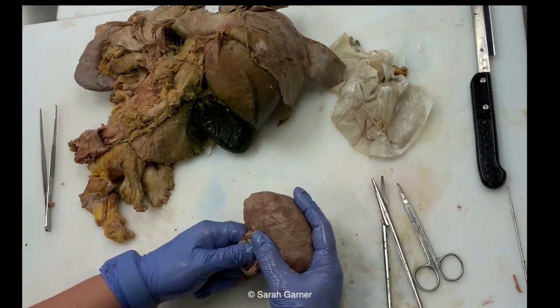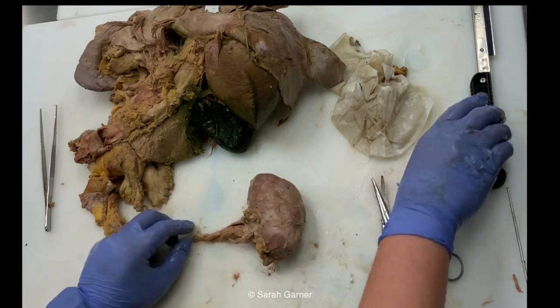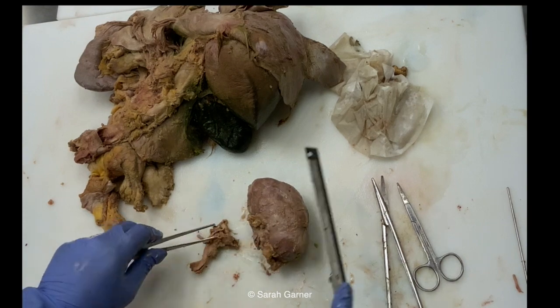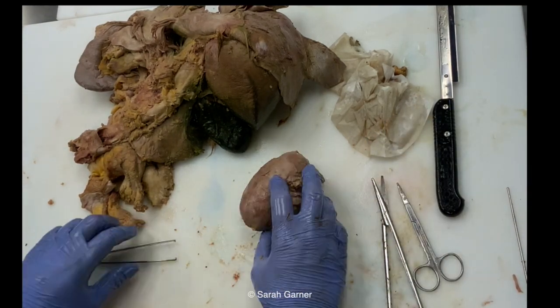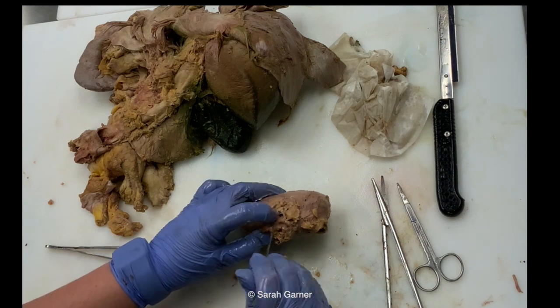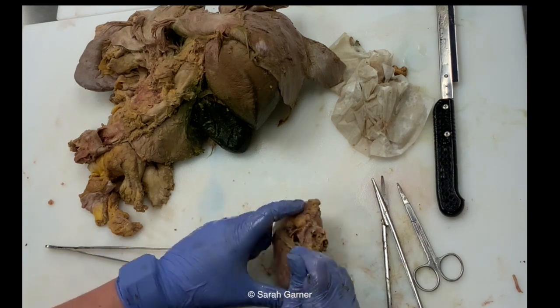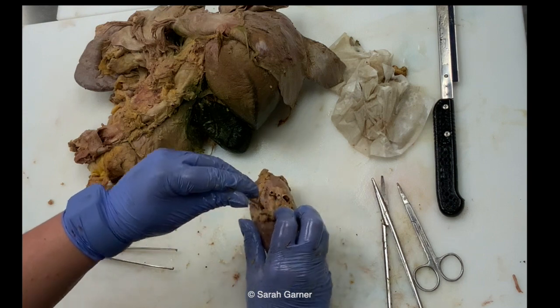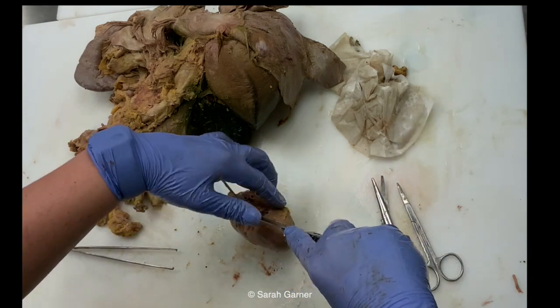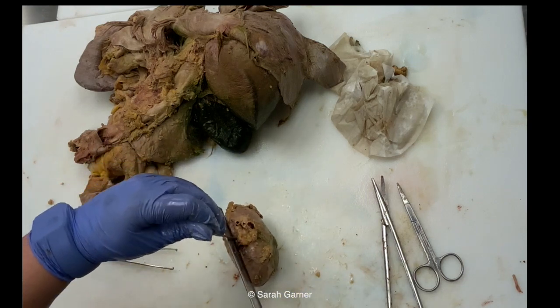So then don't forget to weigh it. So we'll trim off the excess vessels and that excess ureter. And then we'll go ahead and bisect it along the caliceal system. So again, stick your probe inside that ureter and that renal pelvis. Feel when it's lodged, and then you will cut right along.